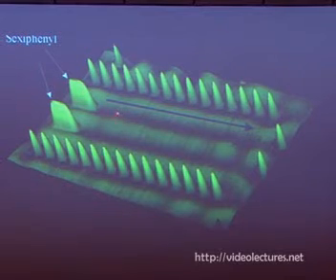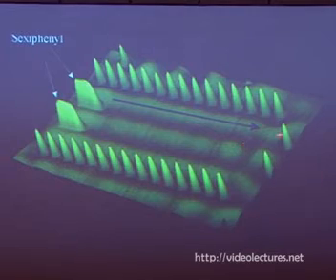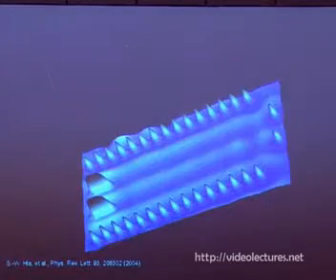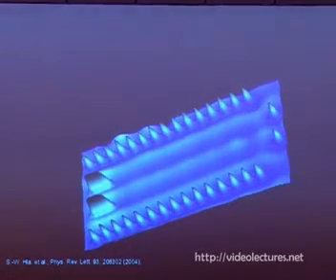Now we can move the molecule and release the tip. The molecule should continue to travel, this time in an atomically straight line, and hit the target. So this is what we use as an individual atom target, single atom targets. And this, we call it a molecule gun. So this is the same one showing a different presentation. And we move the molecules along toward the target, and we shoot at the molecule in the next slides.